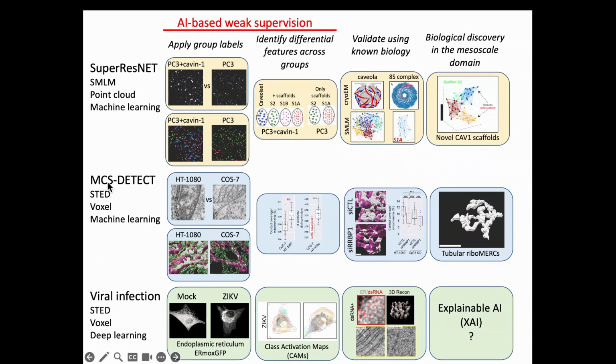We also developed another software package called MCS Detect, which we applied to 3D STED microscopy. Here we were interested in characterizing ER mitochondria contacts, or MERCs.